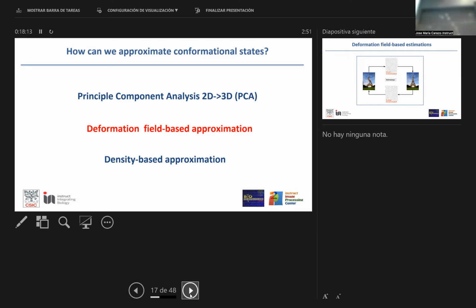And I can attach to each image I am recording, which is coming from a different conformation of the macromolecule, the flexibility parameters. I can estimate and attach the conformation parameters to that particular image. So for my 500,000 particles, I will make 500,000 estimations of parameters, and I will, with all the errors of the world, of course, be able to tell you which is the deformation that happened to the average structure to produce that particular cryo-EM image.